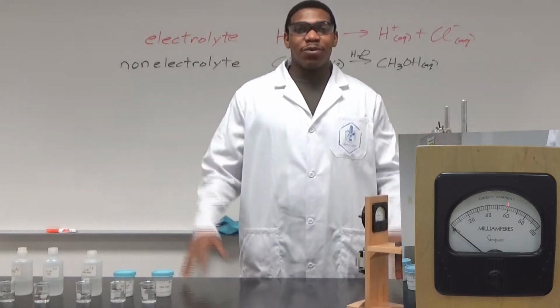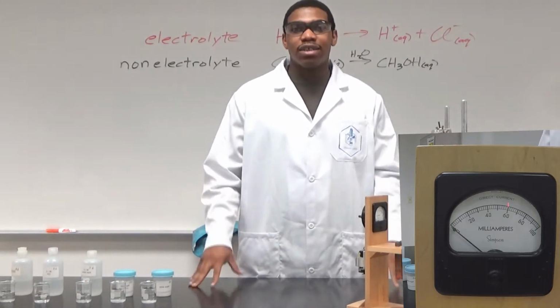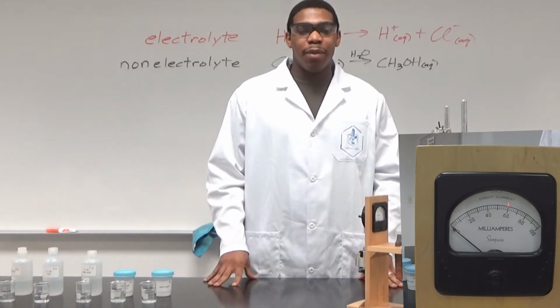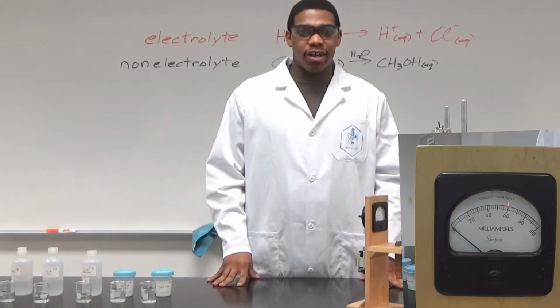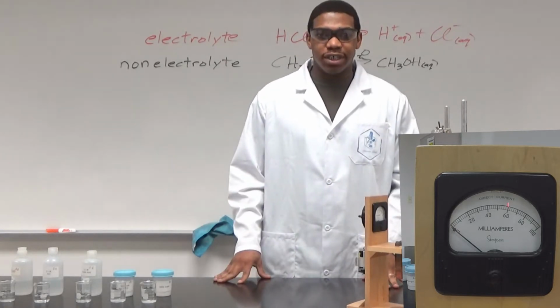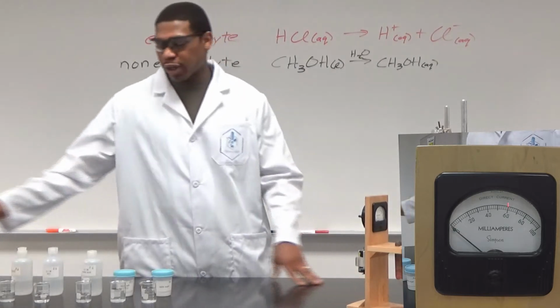In this demonstration, we're going to talk about the conductivity of solutions. The concept we're trying to explore here is which solutions allow for the movement of ions. We're going to explore about 6 different solutions to see which ones are conductive or not, and just give you a feel for conductivity.